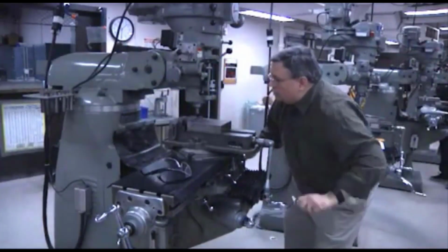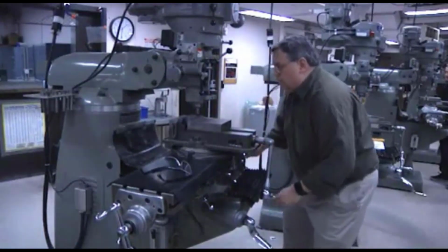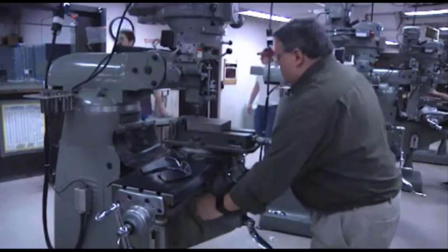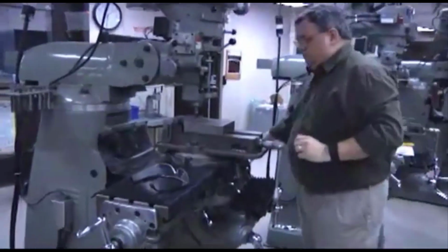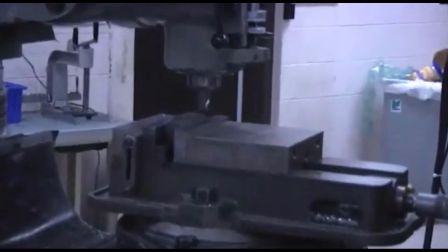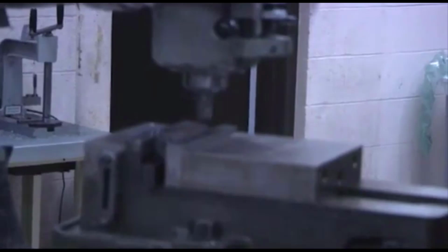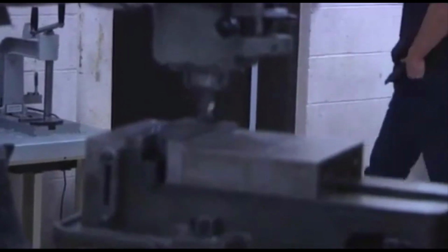Now we need to make sure that the specimen is centered under the end mill so that we get a good surface finish. And now I'm going to bring the end of the bar under the mill and do a touch off where we slowly raise the specimen up until we first see the end mill start to cut. And we'll set that as our 0 point.